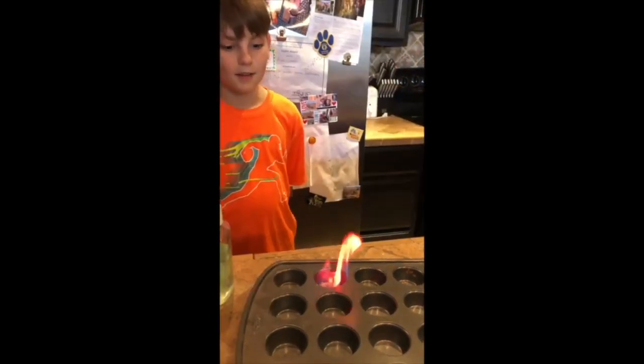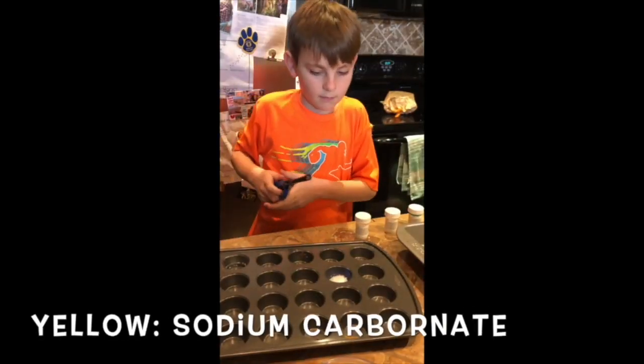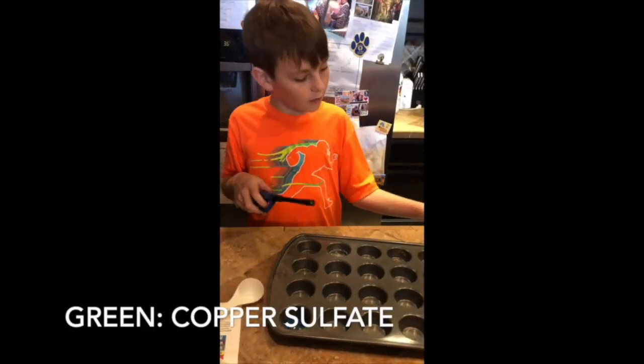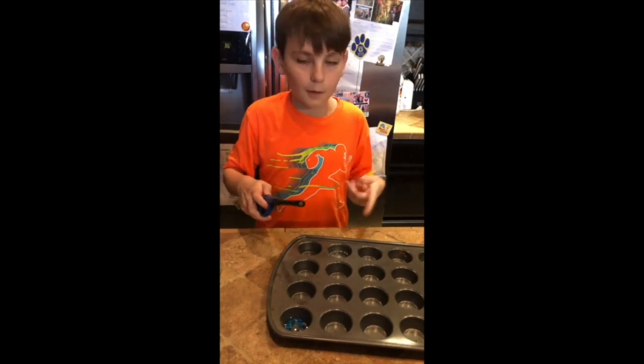Really red. Yep. Alright, it's lit. This is green, right? Yeah, green. And this is copper sulfate.